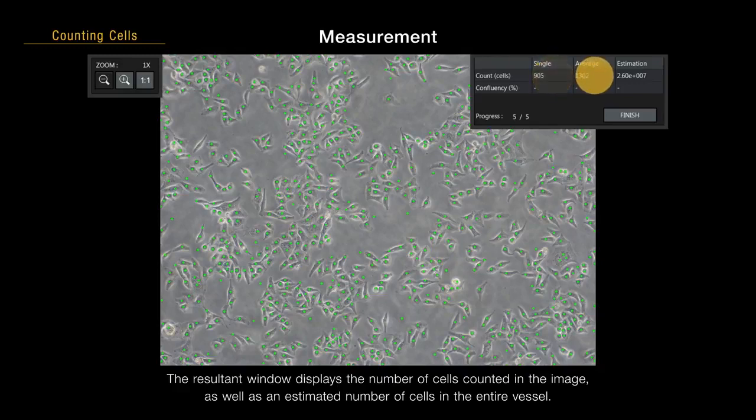The results window displays the number of cells counted in the image, as well as an estimated number of cells in the entire vessel.